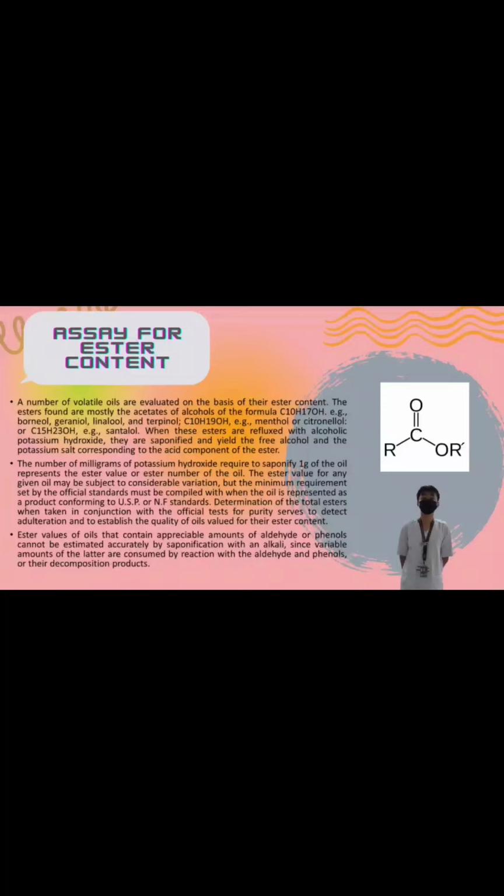The ester value for any given oil may be subject to considerable variation, but the minimum requirements set by the official standards must be complied with when the oil is represented as a product conforming to USP or NF standards. Determination of the total esters, when taken in conjunction with the official test for purity, serves to detect adulteration and to establish the quality of oils valued for the ester content.